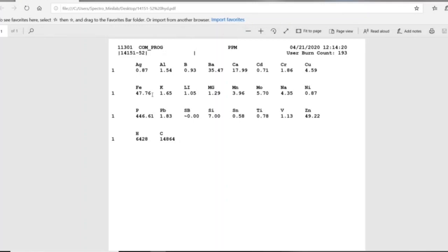and neither does the commercial lab. So that's why our particle counter has the inbuilt large ferrous analyzer as well, so it will pick up anything up to 100 microns. There is a filter that stops larger particles than 100 going through the system, but if you have larger particles than 100 microns, you probably have a broken machine anyway.